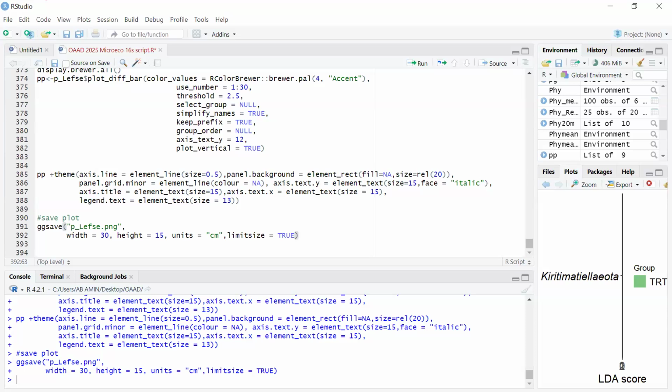So if you really need it, you still need to culture your sample. From there, you identify which kind, from the genus or any available identification, either the genome or phylum, so you will know the type of bacteria it is. Then you can culture that type of bacteria before you send for single sequences. You can take all the different colonies and send them for sequencing. This is almost what we do in our lab, because I work on lactic acid bacteria. We isolate so many bacteria.